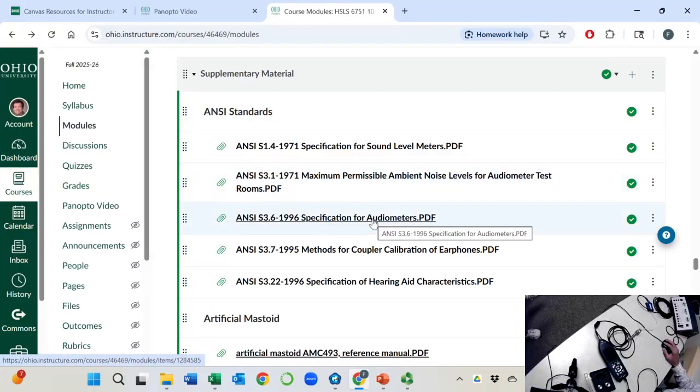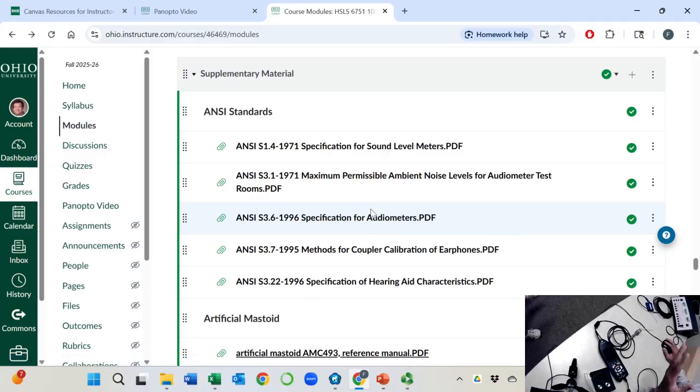Calibration, do you know how old that is? 29 years old. Making sense? So it's definitely out of date, but the procedure, the concept and the knowledge are the same. Just so you know, there are updated versions for sure. I didn't buy the newer version. You need to buy it. It's not free.